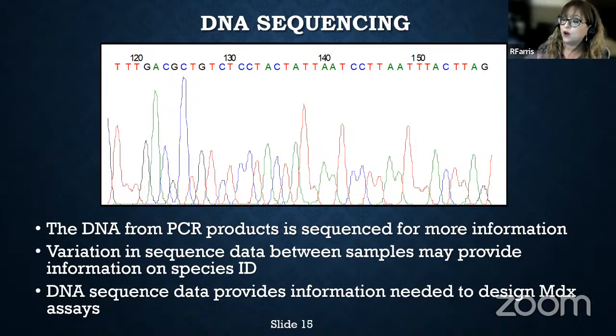Sometimes one of the sequences might have some really poor data, but the other sequence is beautiful. It's perfect. So a lot of times we rely on those forward and reverse sequences because we may get poor sequence data for one of them, but great data on the other one. That can give us the answer to what the actual correct base is. I have spent countless hours going through sequence data and correcting base calls that were incorrect. And that can happen for various reasons.